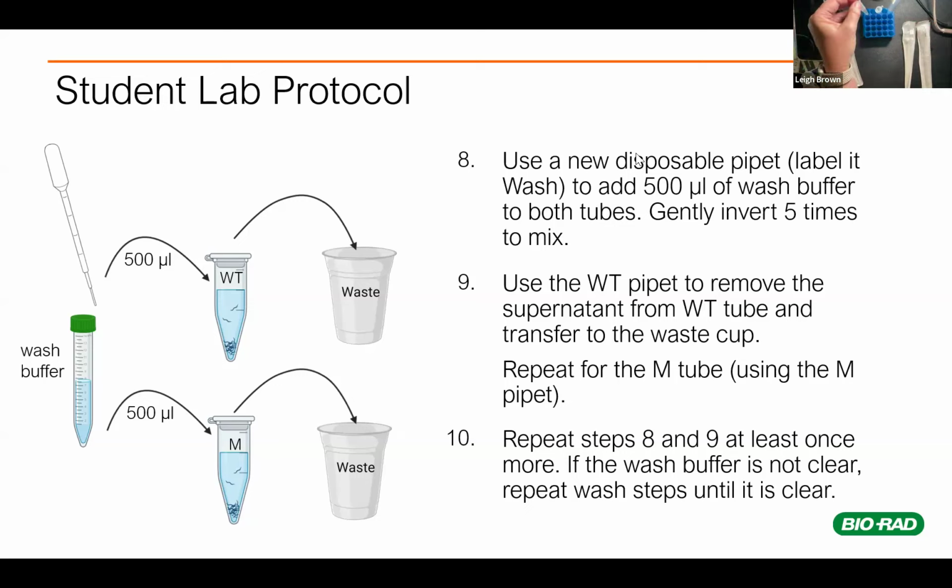Once you've given them that nice little mix, we're gonna do the same thing as we did last time, which is set them up and then let them settle for approximately 2 minutes. And this is one of those protocols where we're looking for a specific outcome, which is just worms pelleting down at the bottom. That could happen in under 2 minutes. It could take longer. So students should be doing a visual check to be like, yep, we've hit the desired outcome, and now I can move on to my next step.